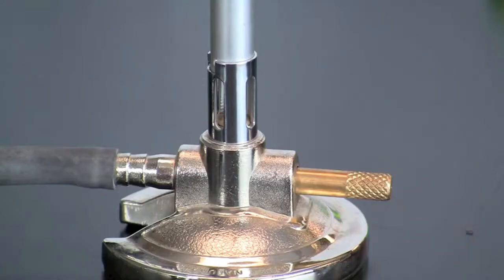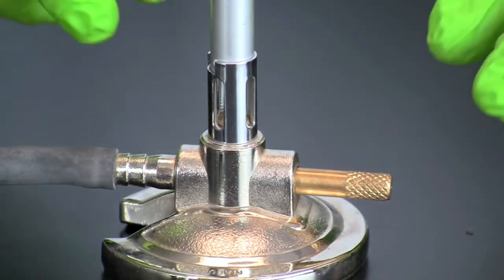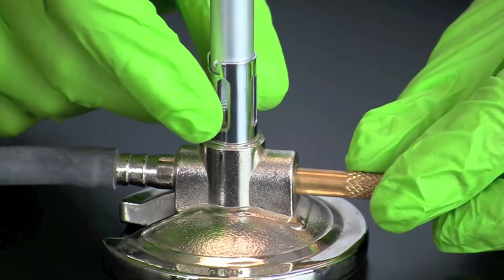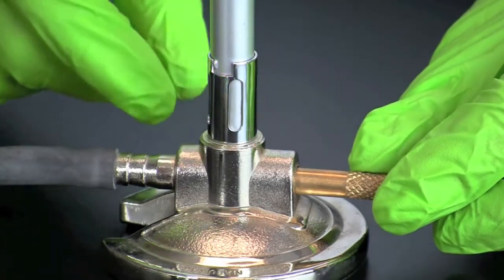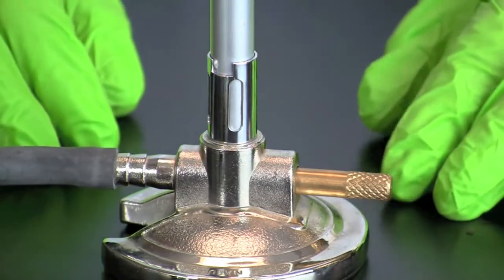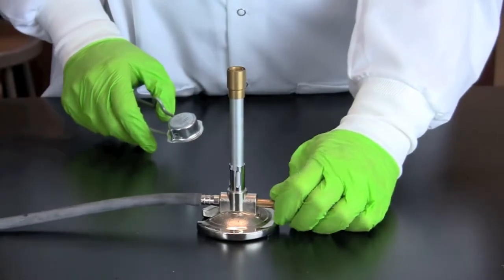To light a Bunsen burner, start by closing the valve at the base by rotating the collar so that the vents are covered. Then slowly turn on the gas.